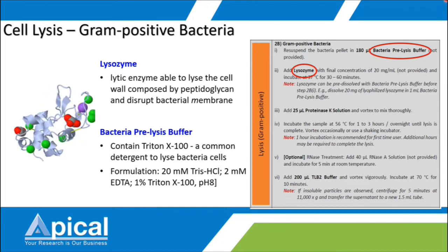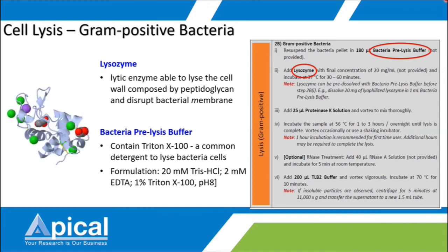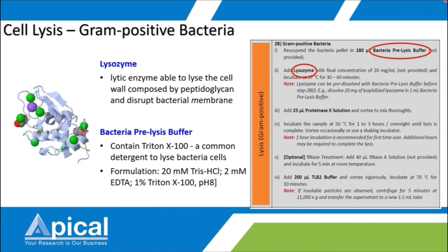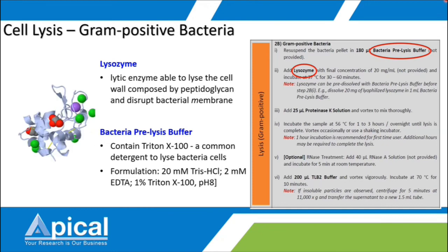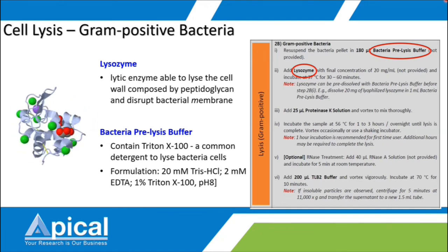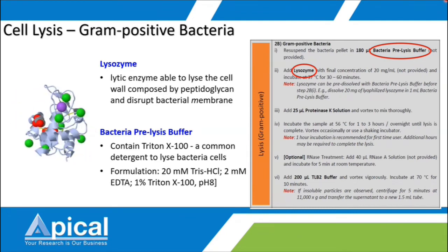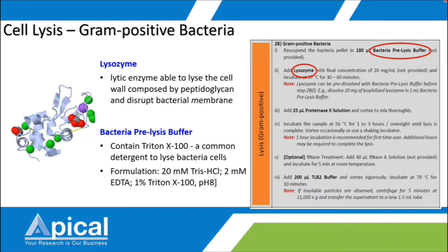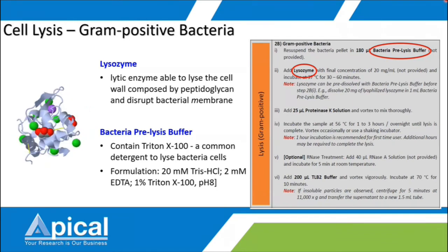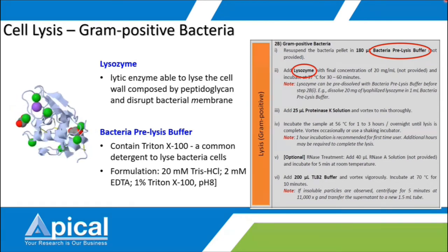Okay, so if you do not have lysozyme, some of you may say, I don't have lysozyme with me, but now I'm already at the step, my gram-positive bacterial cell is already ready. So can I proceed with extraction? The answer is yes. Actually, you can.